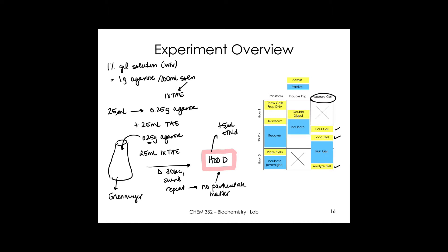In the hood, add 5 µL of ethidium bromide. This is a known mutagen — it intercalates between DNA bases and fluoresces, allowing visualization. Handle it carefully in the hood. After adding ethidium bromide, pour the gel into the casting tray.